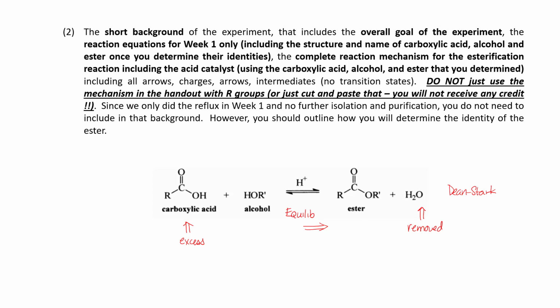In order to get this equilibrium established, that is why we had to do a reflux, and without the acid catalyst, which came from sulfuric acid, the reaction would go nowhere. So if you forgot to use sulfuric acid, you would get no product because it's required as the catalyst for this reaction. Okay, so that's kind of an overview of a Fischer esterification reaction. Again, the big limiting factor here is the equilibrium to form the ester.